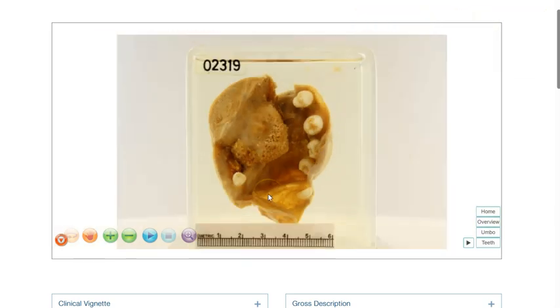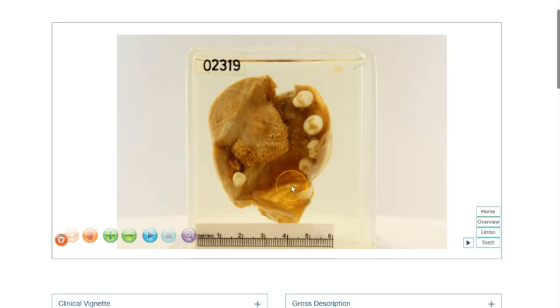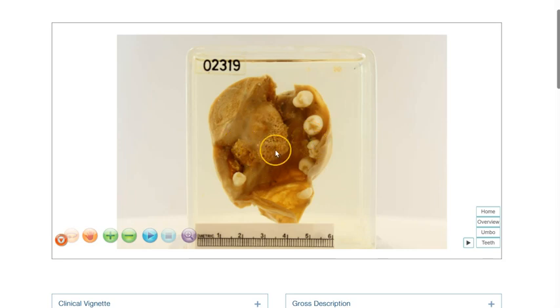This is because teratomas are composed of multiple types of tissue that originate from different germ cell layers, and therefore practically any organ or any tissue can arise within teratomas.